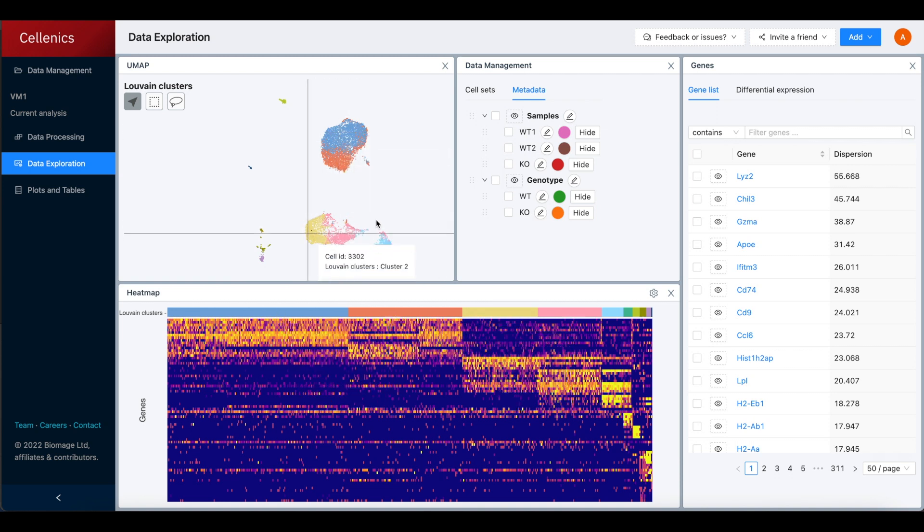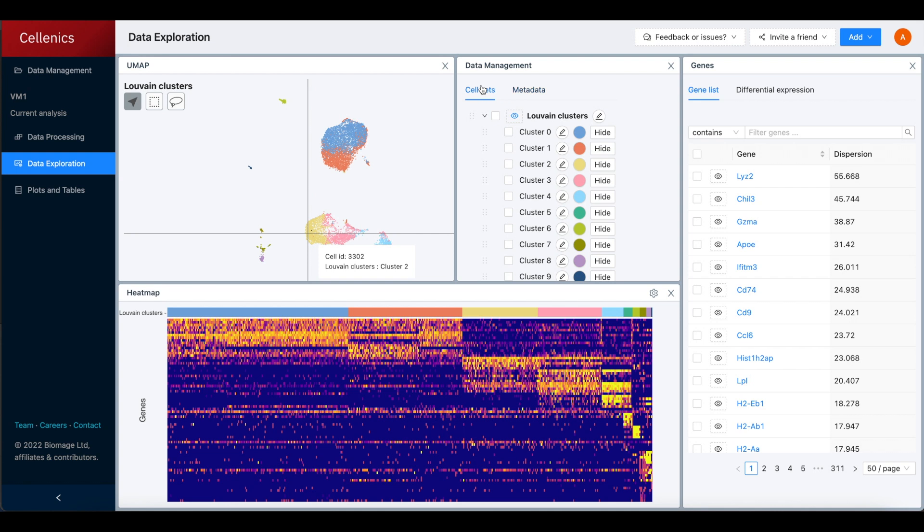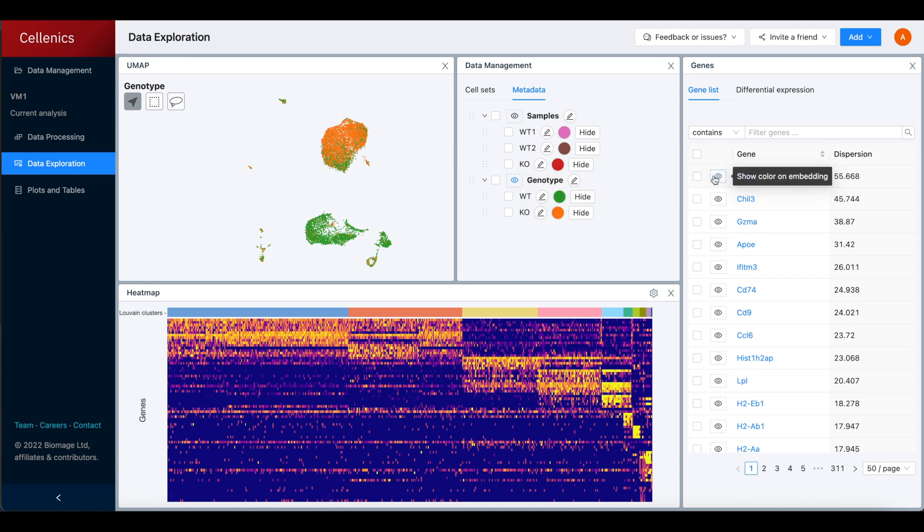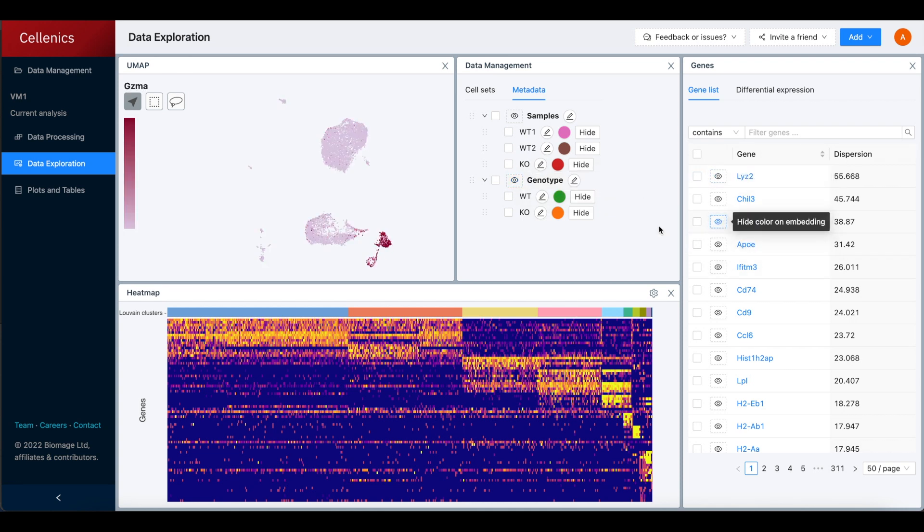The embedding is colored by Luvin clusters by default. Coloring the embedding by sample, metadata, or gene is easy using the eye icons.